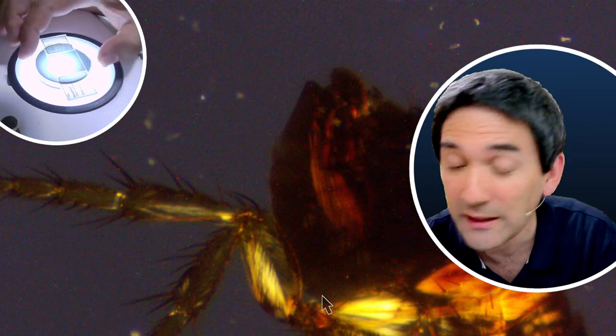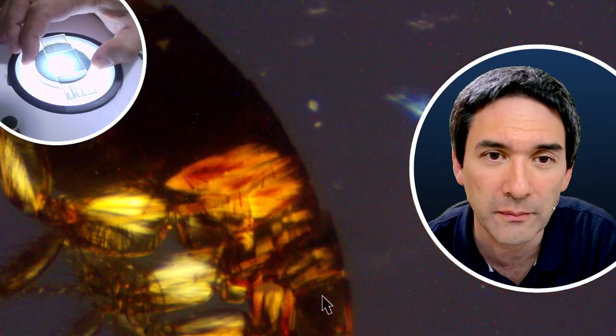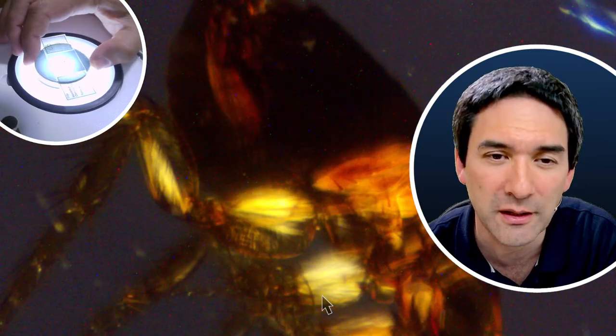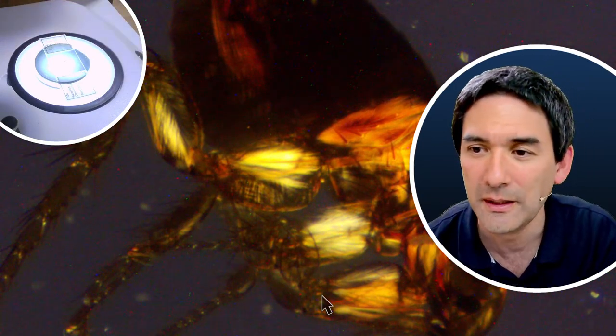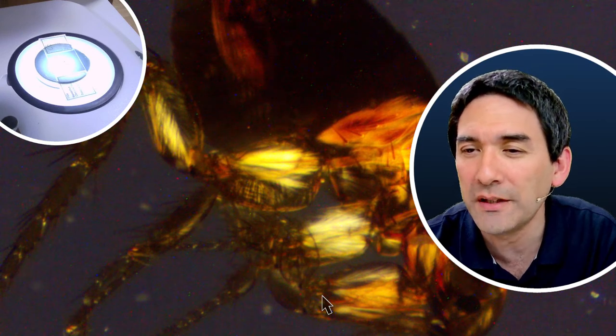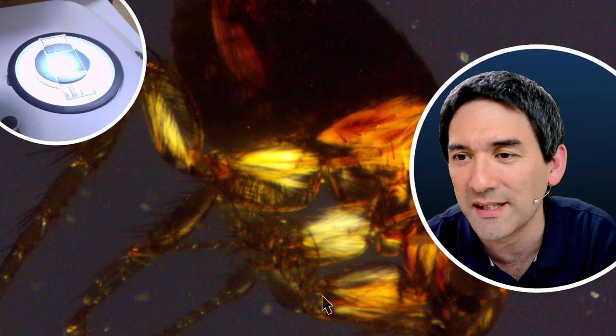And I think again that this has to do with the regular arrangement of the muscle fibers. Not the muscle fibers, the actin and the myosin protein filaments inside the muscles. So sand grains will also be a very nice sample. I've got a whole bunch of sand grains in my cellar. I forgot them.